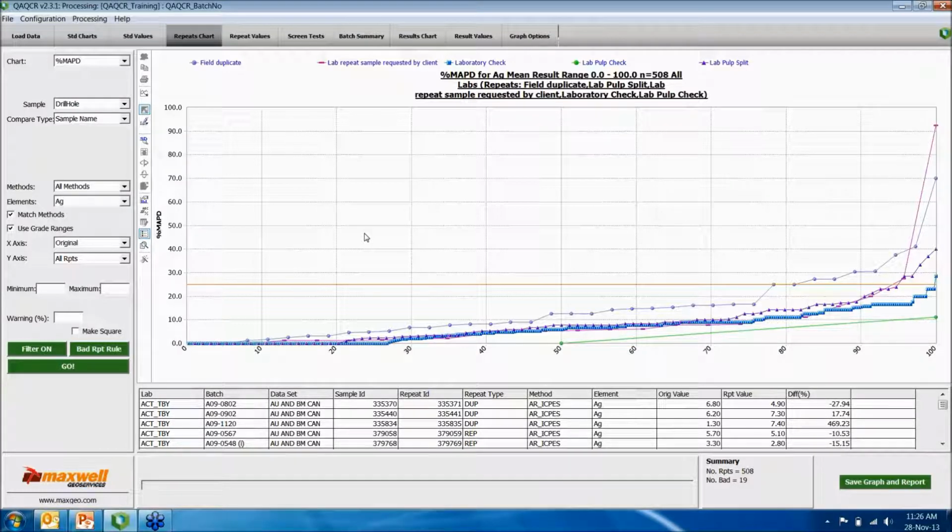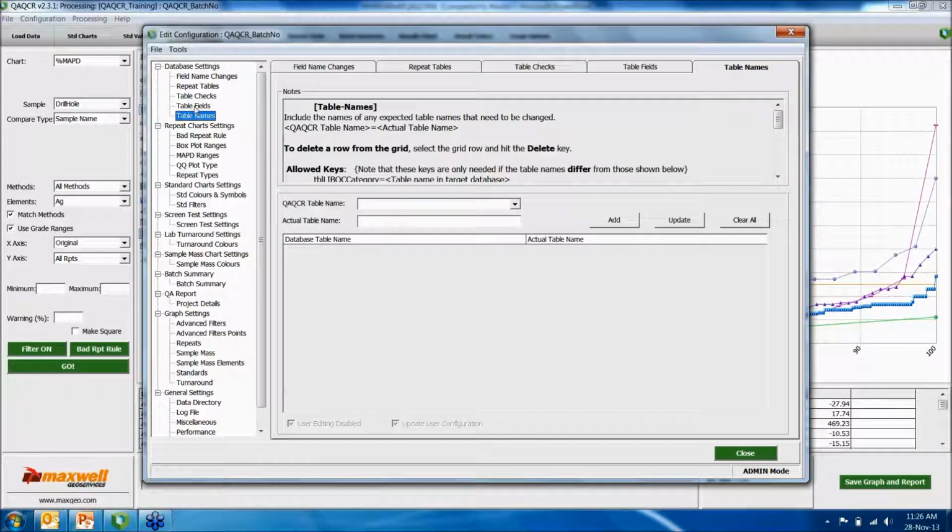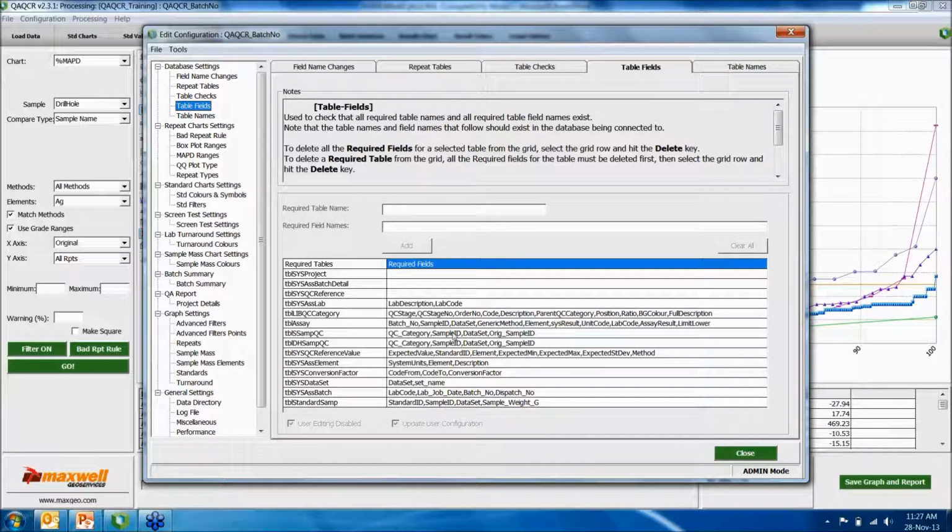It was also enabled to overcome crashes in various conditions. It's now pretty much very stable at the moment. The old has been upgraded. And also in the edit configuration, this has been disabled because it's making a lot of issues when it's highly customizable, that clients keep on changing things and just wasting a lot of their time.